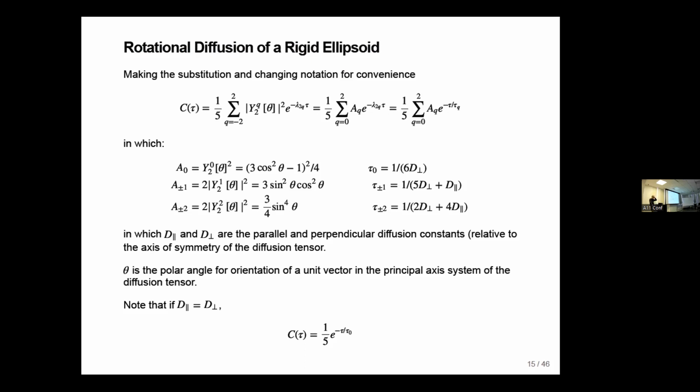This leads to another complication you might imagine, which is that if we're measuring NH relaxation, we also have the CSA of the nitrogen. And the CSA tensor, even if we imagine it as being approximately axial, it's not completely axial, and it doesn't point quite along the NH bond vector. It's tilted by probably 16 or 18 degrees.